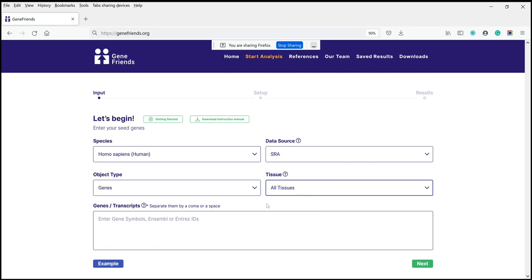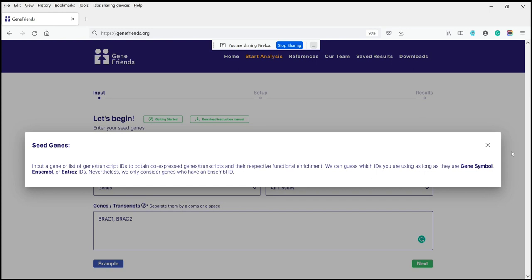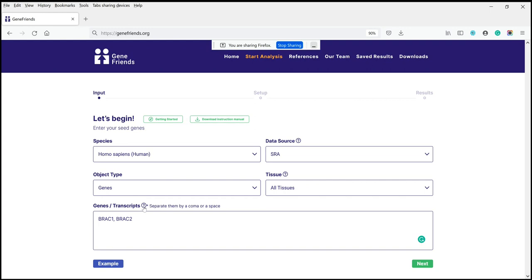I will use human data because that's what most users employ and for which we have more data. We can select particular kinds of genes. Because GeneFriends is a guilt-by-association approach using co-expression networks, you can use individual genes or combinations of genes. For example, let's say we want to look into genes that are co-expressed with BRCA1 and BRCA2. So we just write BRCA1, BRCA2. The system will accept different types of identifiers — gene symbols and Ensembl IDs. We're using all tissues combined with SRA, which means a bigger sample size. If you're interested in general functions of a gene, this is what I suggest you use.